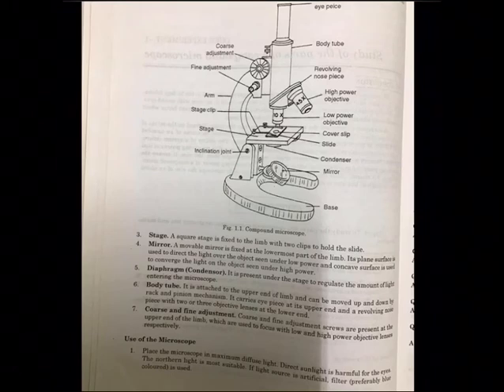Care for the microscope. This is very important. Many times you just carry it with a single hand. That is not correct. You must handle it carefully. One hand you must use for the arm, another hand at the base. You must keep support for the base and lift it. Otherwise the mirror will be broken. So be careful while handling it.